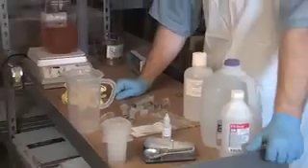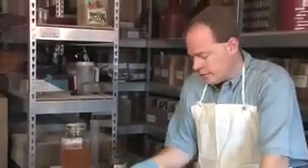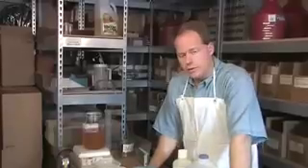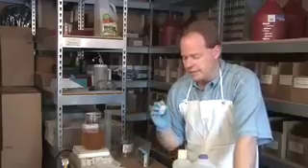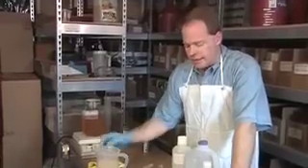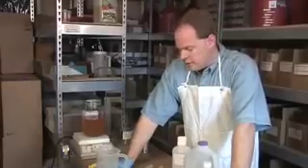Titration kits can be had on the internet from various sources. You can go into Walmart and build one up — I offer one as well. What you see here is basically my titration kit minus the water and the alcohol. You can go to Utah Biodiesel Supply, which is where we have ours. Expect to pay a little bit for shipping because they have to send chemicals in them. Phenolphthalein can also be ordered online or at chemical stores. A good scale you can find on eBay. So that's what you need to do a basic titration.